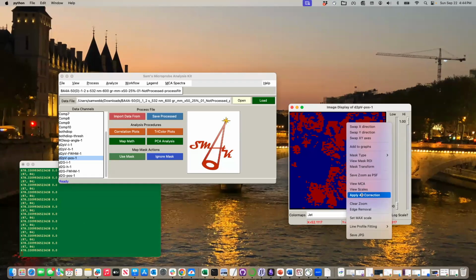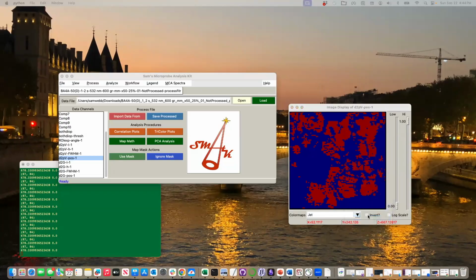And if I do something like, if I set the maximum scale here to be 668. Okay.